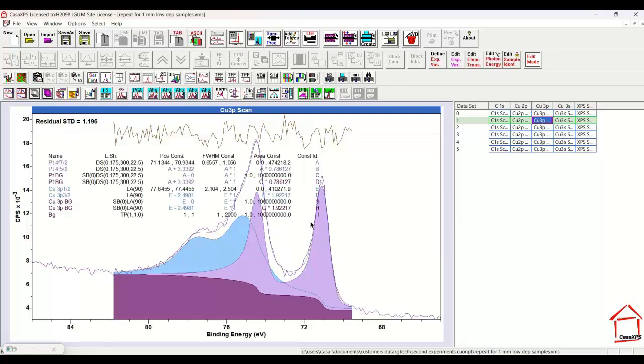Attempting to use a peak model that involves asymmetric line shapes and relatively broad structures might be questionable. It certainly is fraught with danger that, depending on the choice of the asymmetry, we may alter the relative proportion of the copper. But why would you choose then to fit the data from platinum and copper if there are other photoemission peaks that you might use to work out the ratio of copper to the platinum?